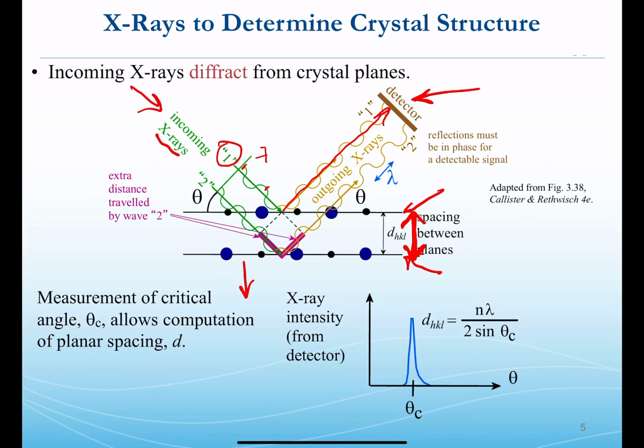Because incoming radiation is often large in its source, we have wide and many parallel beams of monochromatic, the same wavelength, X-rays coming in, so we can expect a neighboring ray of X-rays to come in. And it may travel between the first and the second layer of atoms as it interacts with an area between atoms and passes to the next area. And so that's what we see here, a parallel beam of X-rays may penetrate deeper into the sample and travel further, therefore. So that extra distance that ray 2 has had to travel is important. It's gone an extra distance here, shown in pink, before it found the next atomic layer that's available for a reflection, and then it'll do the same extra distance there. So the pink, as shown in this diagram, is representative of the extra distance that arbitrary ray 2 has had to travel relative to the distance traveled by ray 1.